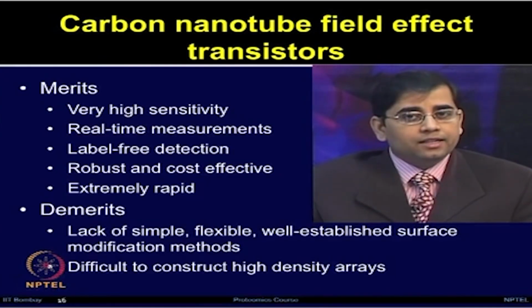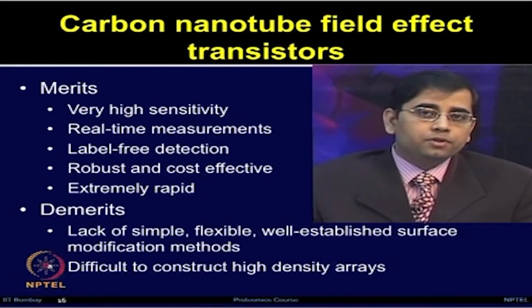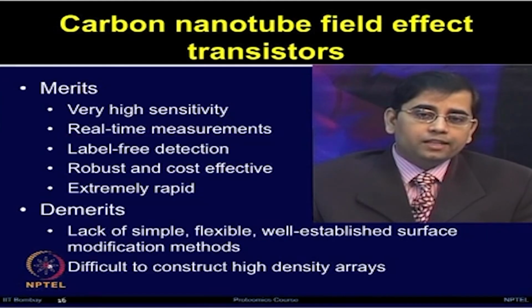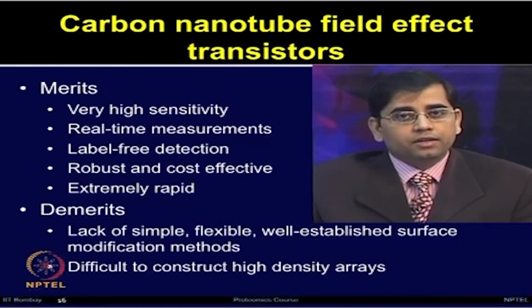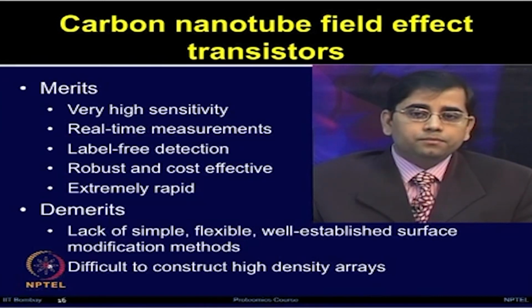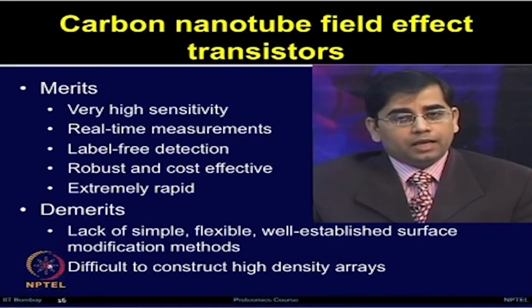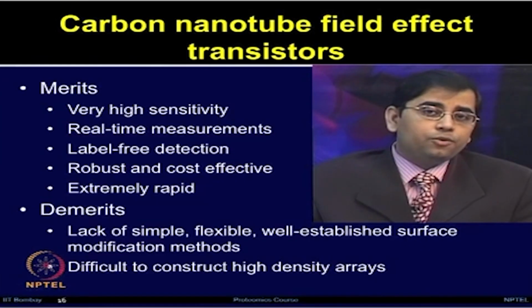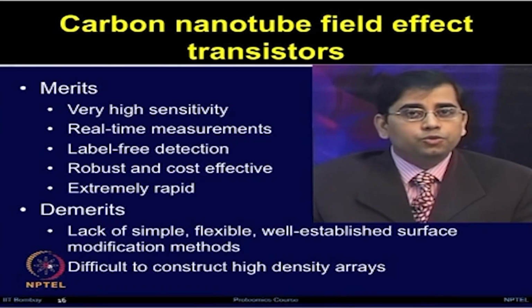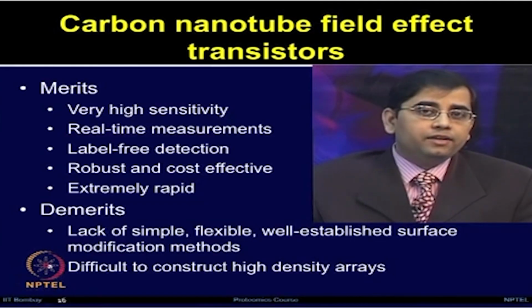There are various demerits of carbon nanotube field effect transistors, which include the lack of simple, flexible and well established surface modification protocols. When we talk about application of these nanotechniques with microarray platform, then this particular platform is difficult to construct for the high density arrays.